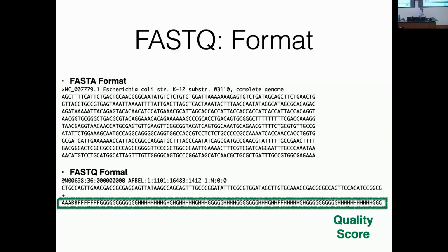For Illumina data, the best you get is about a 1 in 10,000 error rate. So for the highest quality data you can get off an Illumina sequencer, there's a 1 in 10,000 chance that C is actually not a C. In this case, for an A, I'm going to say it's about 1 in 2,000, 1 in 3,000.